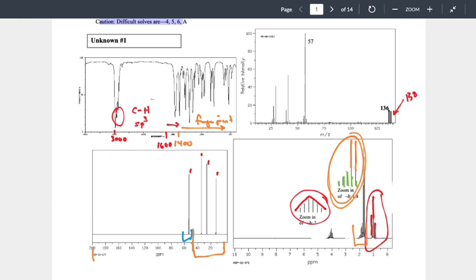Okay? This particular system, while being harder, isn't as hard as it gets because we can at least see that we have two different things aligning into it. These are significantly shorter. None of my splitting patterns are going to go short, short, short, through the roof tall, and then nothing. That doesn't make sense. What makes more sense is I have overlapping signals here, which if we then go through and count, I have 4 signals, which is what Doobie was able to just recognize right away. Joshua put words to it. We're looking at the symmetry behind those patterns to try and predict them.